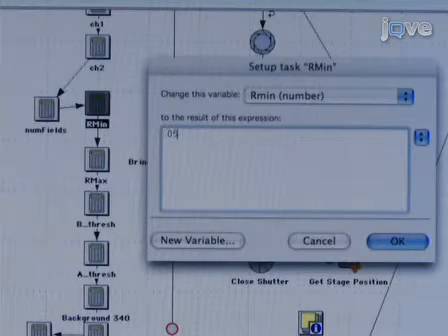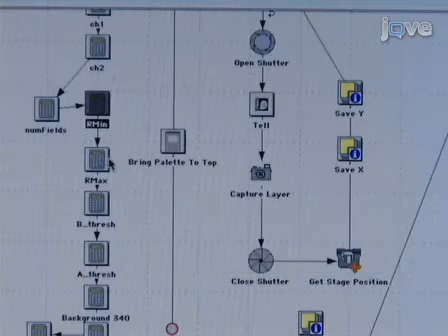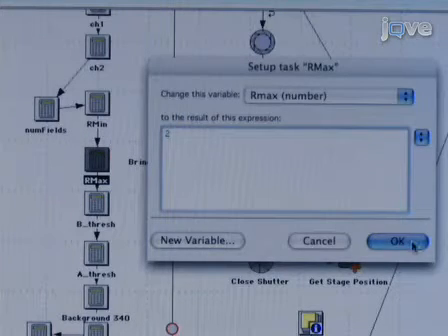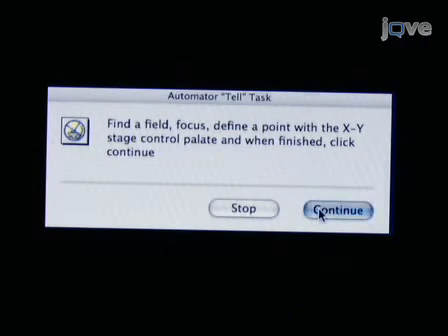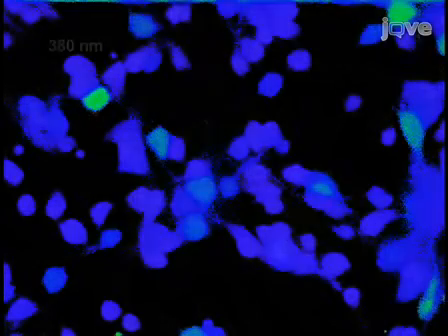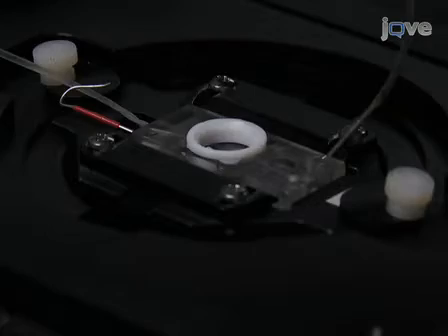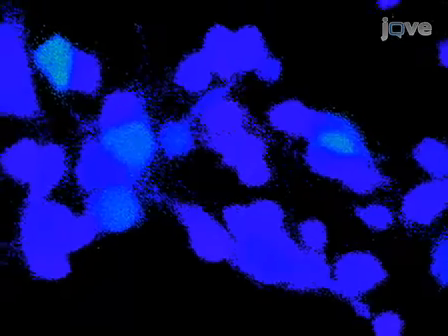Next, enter the maximum and minimum ratio values, Rmax and Rmin, which were determined previously. Once Rmin and Rmax are set, choose the fields you plan to image and use the automated stage to record the location of each field of view in the software. We generally collect five fields of view. Now start the experiment and collect images. During an experiment, the automated stage moves to a field, collects a ratio of images at 340 and 380 nanometers, then moves to the next field until it returns to the first. If you need to collect images quickly, only collect ratio images from a single field.